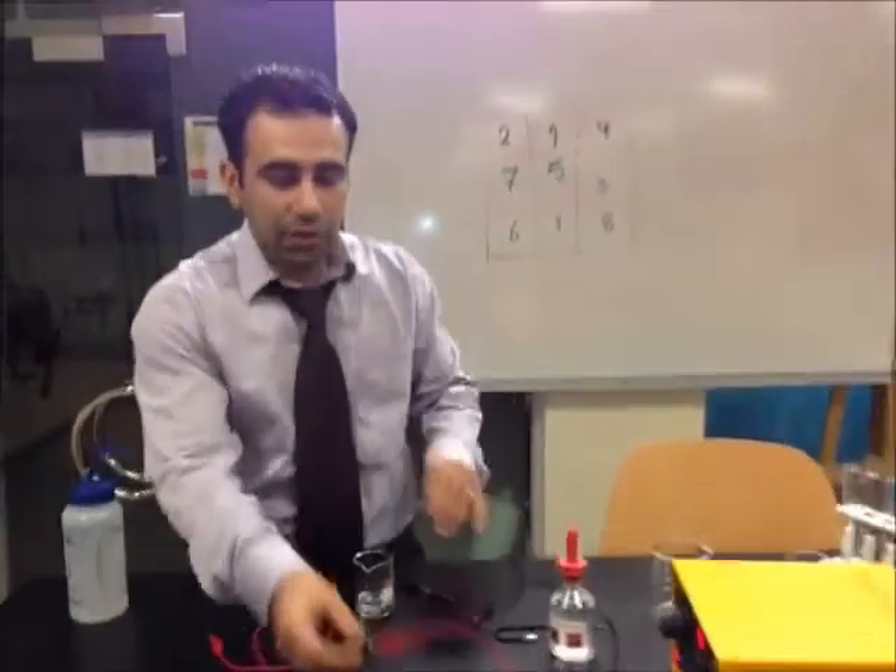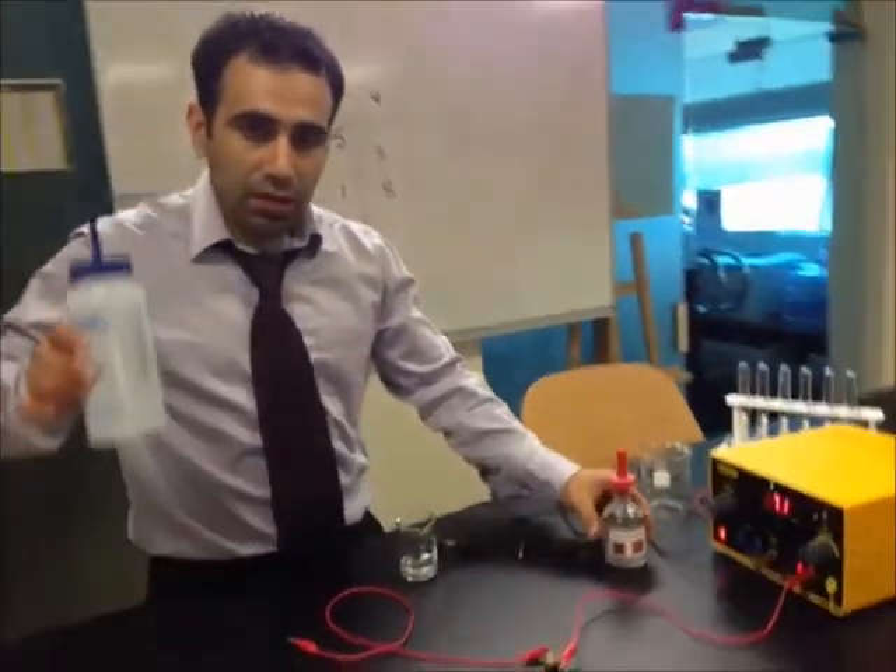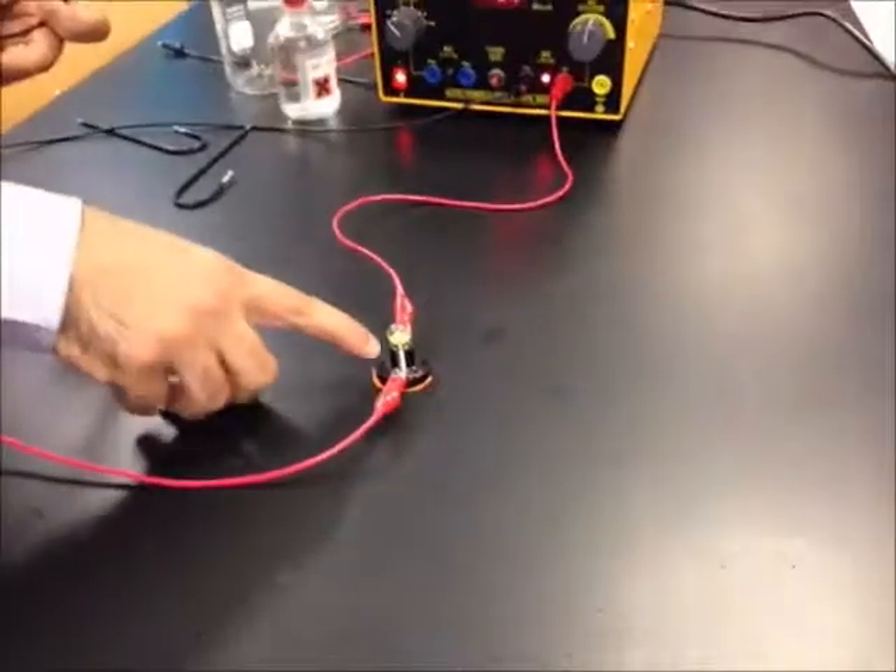The electrical conductivity for HCl and water. Here we have a light bulb. I'm just going to show you that it's working.